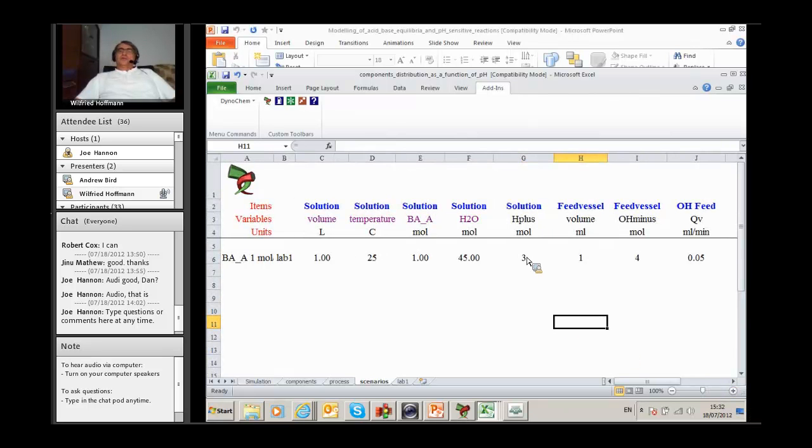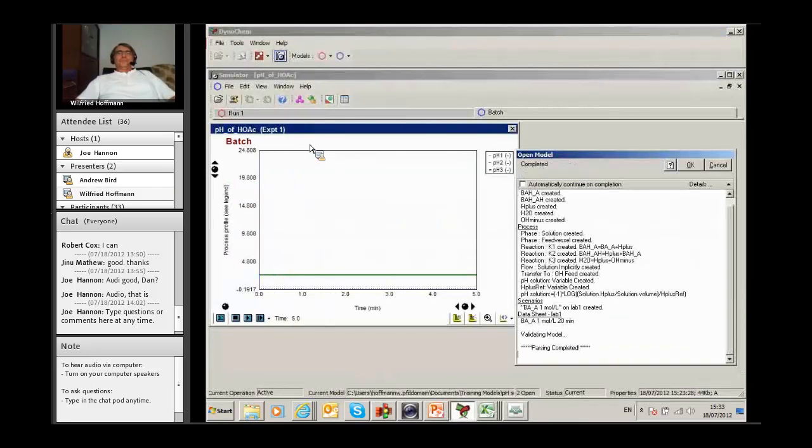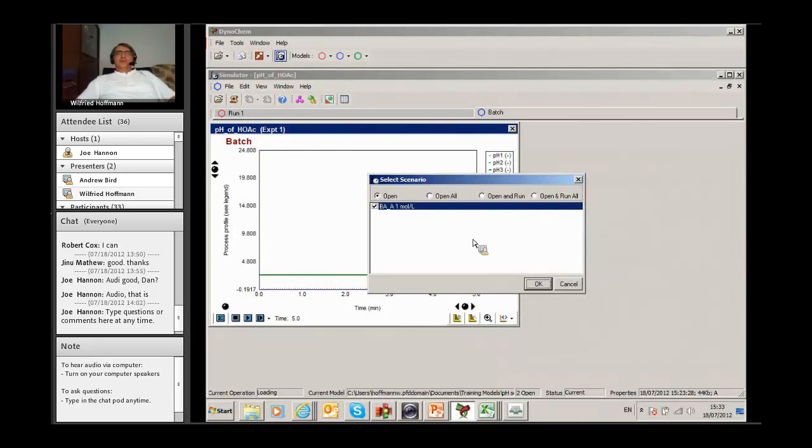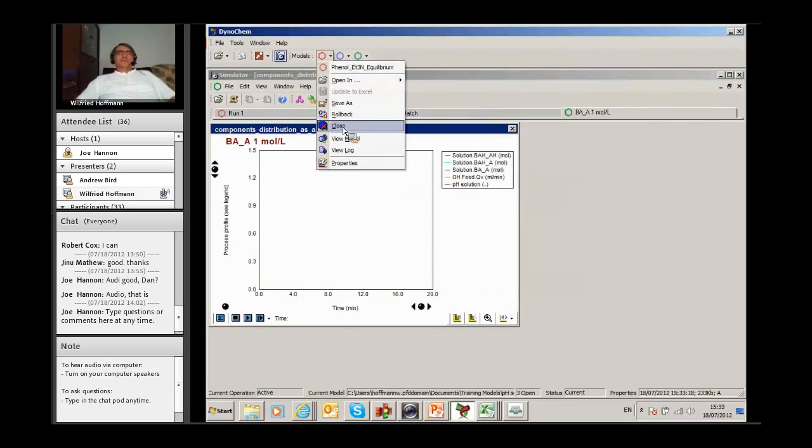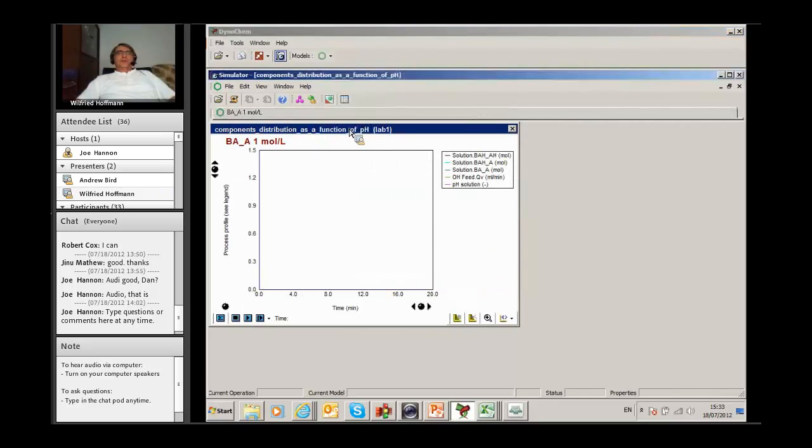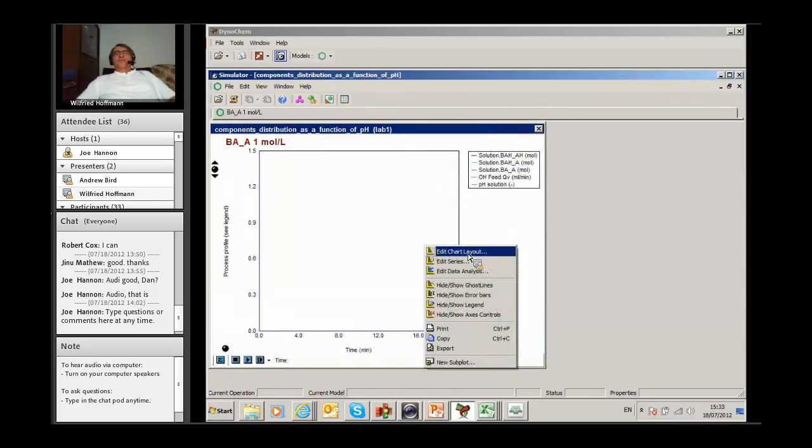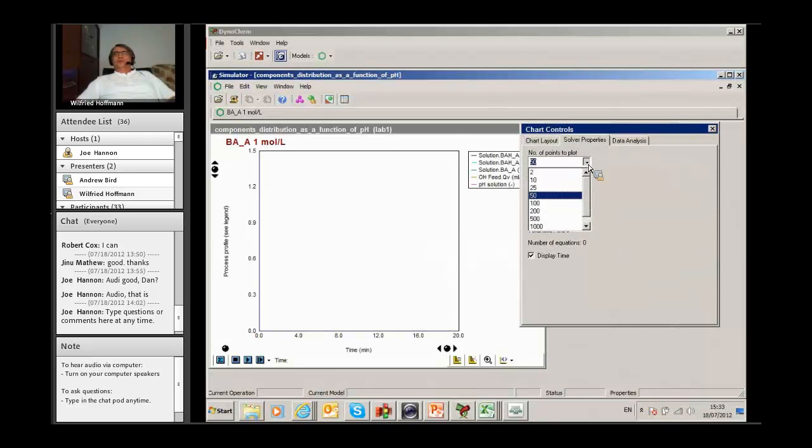Then we have the scenarios here. You see we start with a liter, one mole of benzylamine-aniline, so the starting material. I added the water, it's a rough calculation because I don't know the exact densities and distributions, but it doesn't matter. The point in this, it's a little tricky, is I added just three moles of H plus just to get it to a very low pH. This model is not charge neutral but for this purpose that doesn't matter. I also added four equivalents of hydroxide to get the pH to 14.